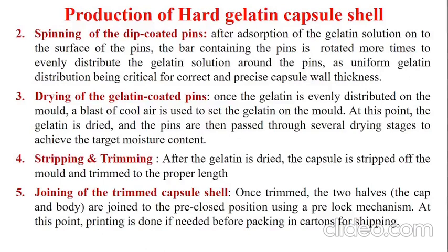For proper distribution of gelatin solution around the pin, the spinning, that is rotation, is very important.